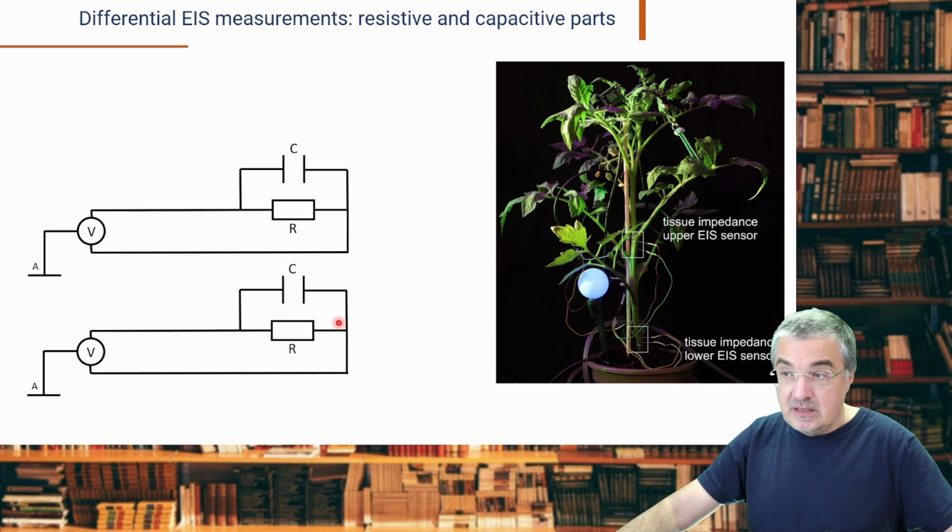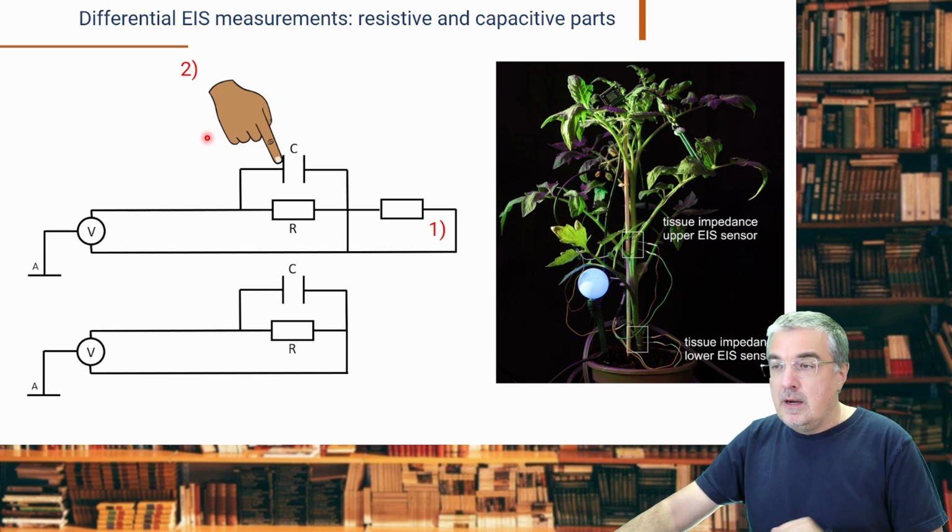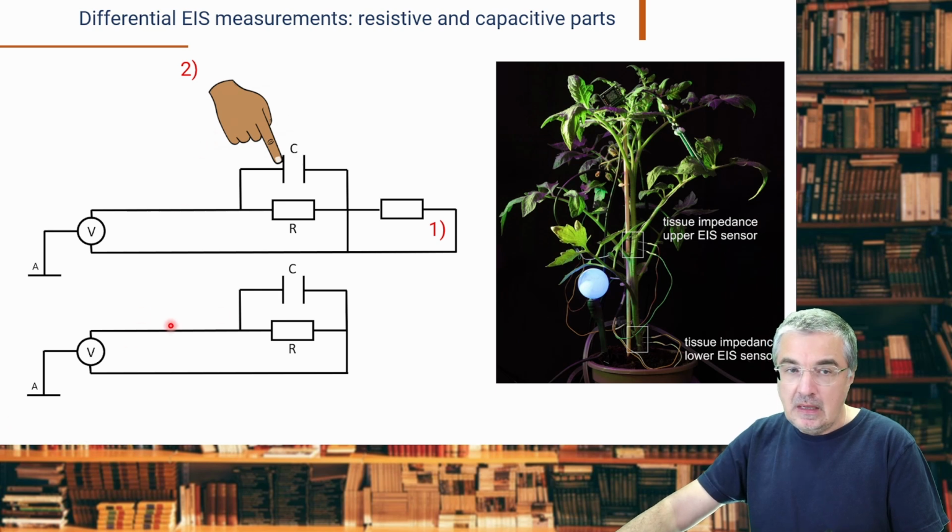This was also one of the questions we received. We already answered this in the context of water research. Here in the plant it is a little bit more complex than in the water research. So here we will consider again the resistive part and the capacitive part. I prepared a small demonstration here on the table, and we will in fact demonstrate both cases.